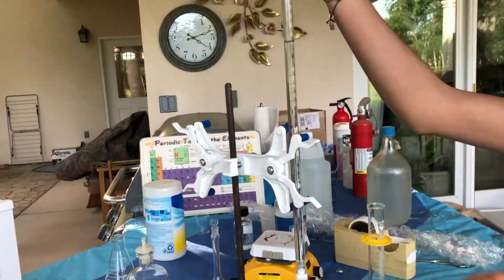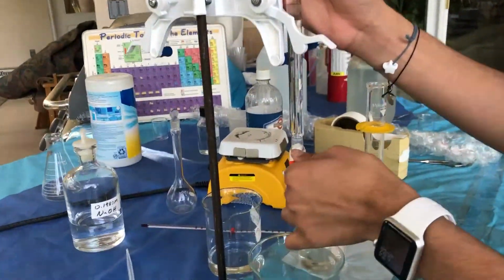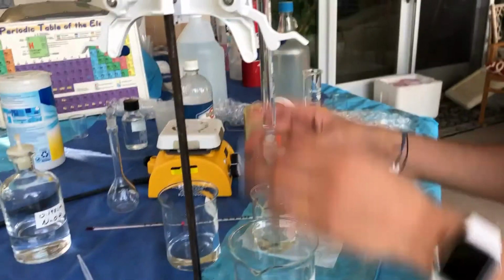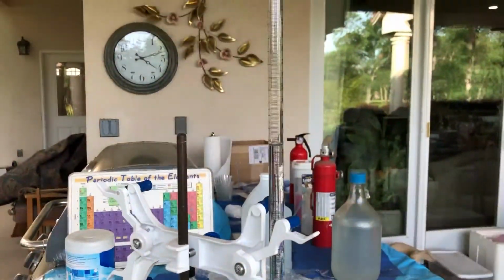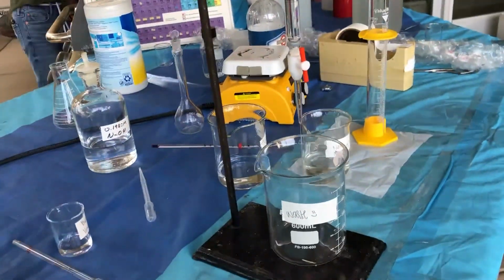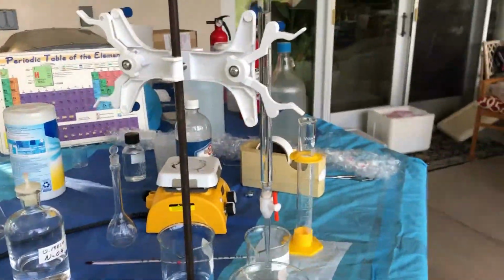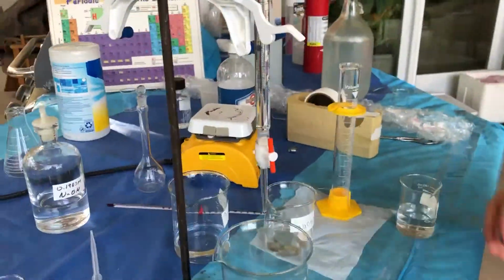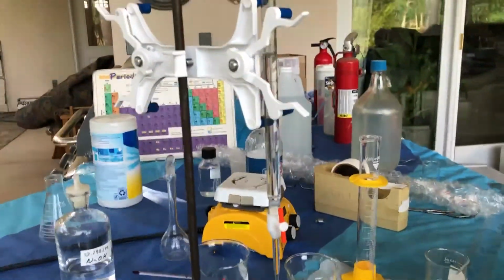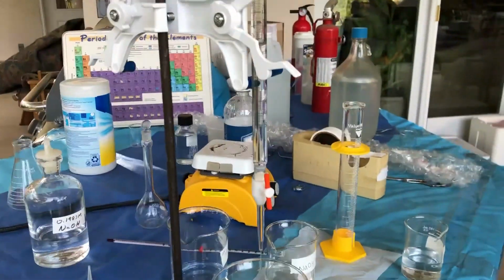It's time to set up our burette. And normally when you walk into a lab and grab a burette, it's half filled with DI water. So we're going to drain this out into the waste. So you let this fully drain out into the waste. It might take a little while.